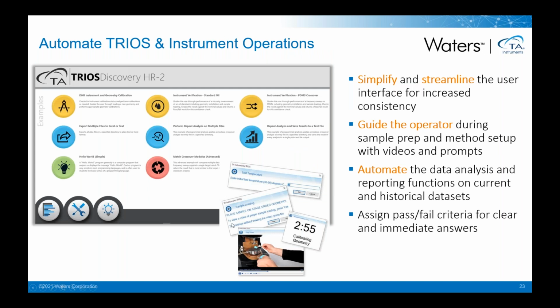But the opportunity you have here is to simplify the interface. If you're running the same or similar experiments, or you have a specific experiment tied to a particular operating procedure, a particular method, or a specific production line, you can simplify the interface so that you're always going to the same place, running the same test, and running the same type of analysis. That really allows you to capture results and information a lot faster.